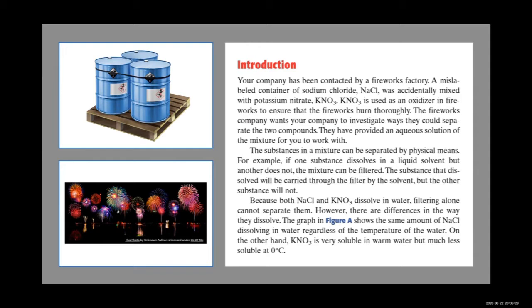The substances in a mixture can be separated by physical means. For example, if one of the substances dissolves in a liquid solvent but the other does not, the mixture can be filtered. The substance that dissolved will be carried through the filter by the solvent, but the other substance will not. Because both sodium chloride and potassium nitrate dissolve in water, filtering alone cannot separate them.